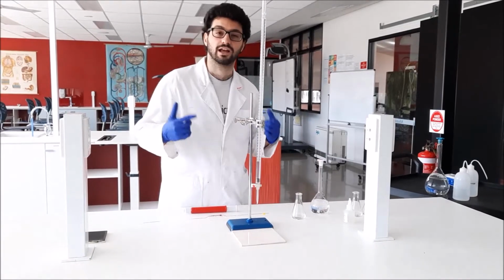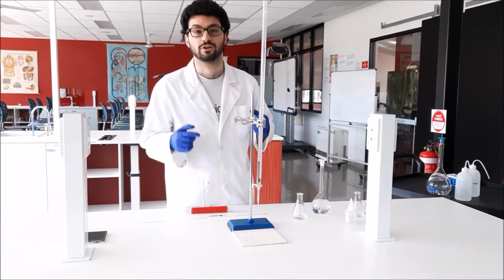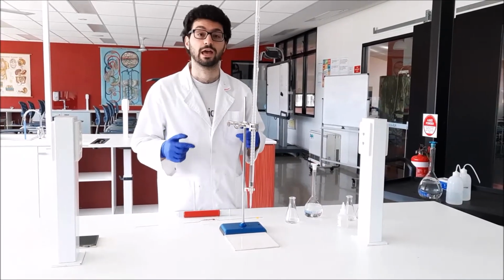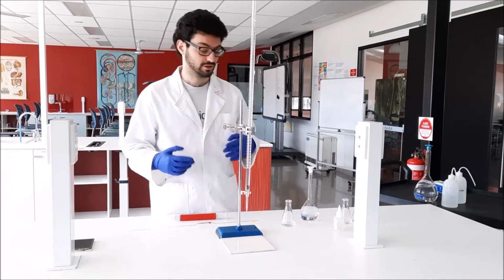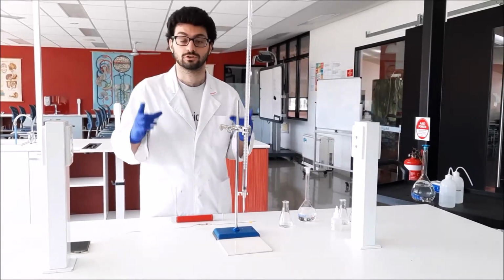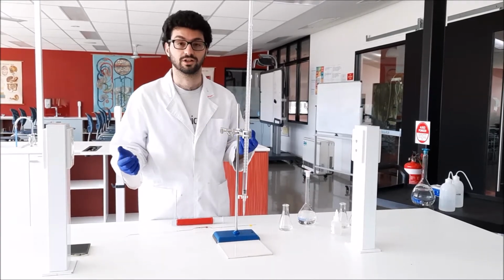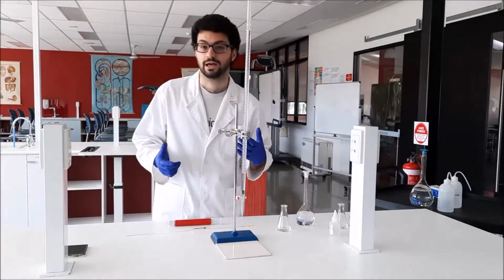Hi guys, today we're going to be doing a titration. So I'm going to run you through all the different pieces of equipment we're going to be using, as well as showing you how to actually do our titration. So hopefully you've got your documents that I've sent you, and all you need to do is fill it in while you watch the video. So let's run through our equipment first.